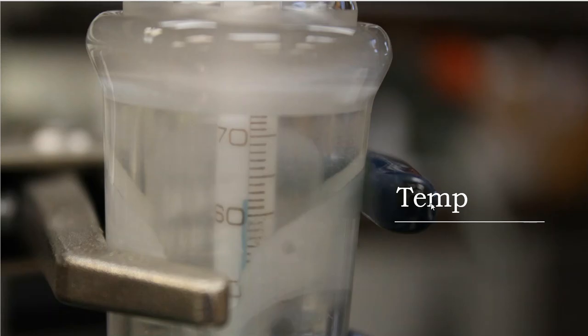All right, so as I look at my temperature, look right in here in the joint. What does it show me? It shows me about 62 degrees, doesn't it? Okay, well, if you look in your laboratory directions, your solvent was tetrahydrofuran, THF, cupcake.